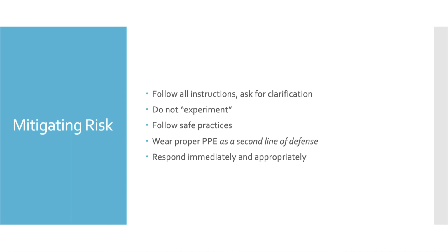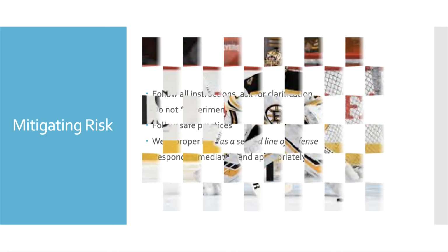If there's something broken, something spilled, whatever, take responsibility, get it taken care of, because if you don't, it could be the next person that has a problem. If you spill water on the floor and you don't clean it up, it'll be the next person that comes along that slips on it, and we don't want that to happen. So don't be afraid. We don't charge for broken things in lab, and I may grumble and I may roll my eyes, but I'm not going to get mad about these things. We just need to make sure that we get things cleaned up, and we'll talk about, hey, how can we prevent this from happening next time?